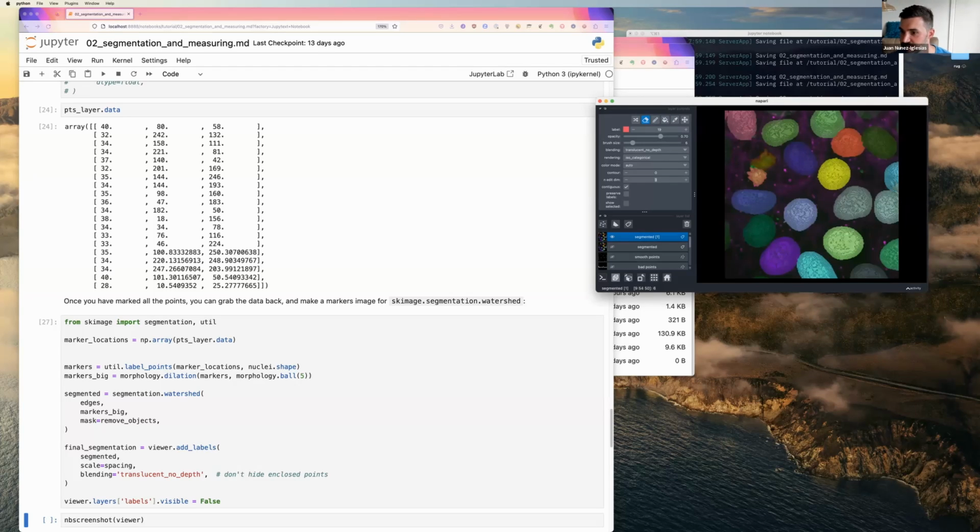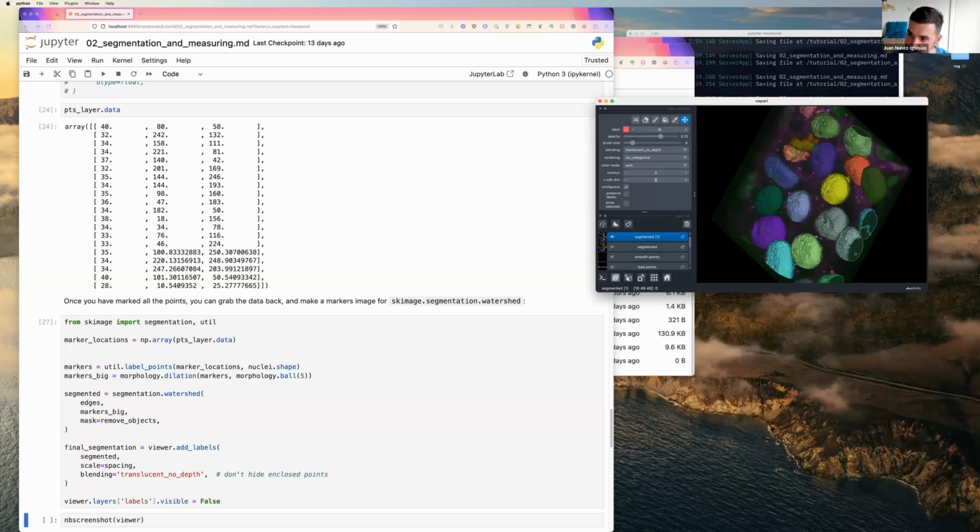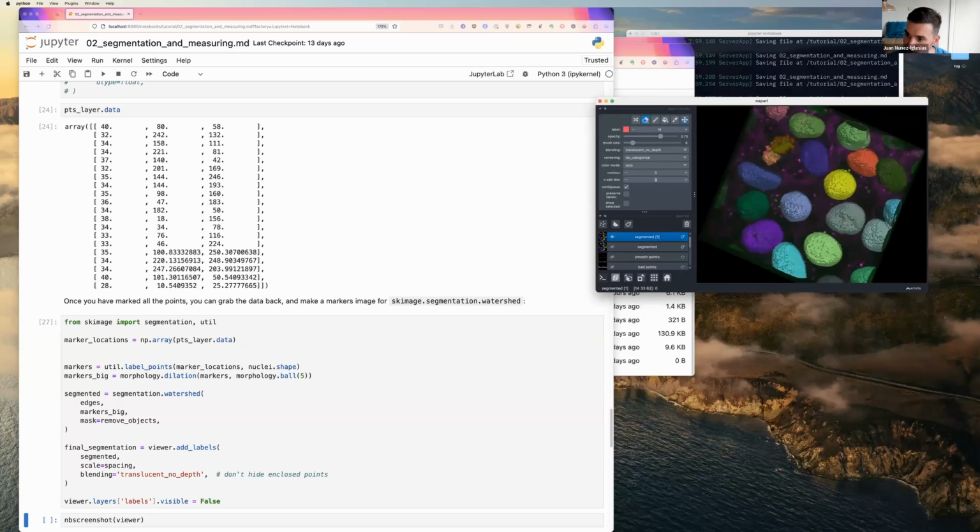So this one, we can again rotate here, separate the two, pick this value and fill. All right, so that's just a little bit of a preview of the kind of editing you can do in 3 dimensions in Napari.